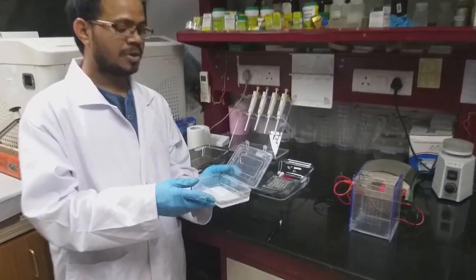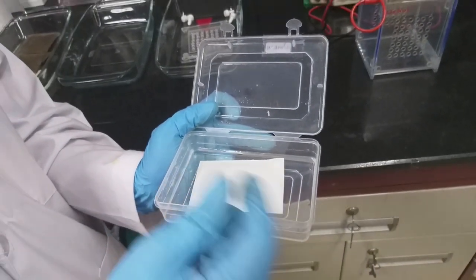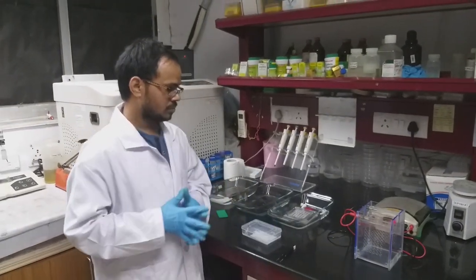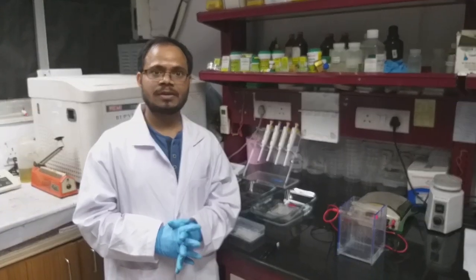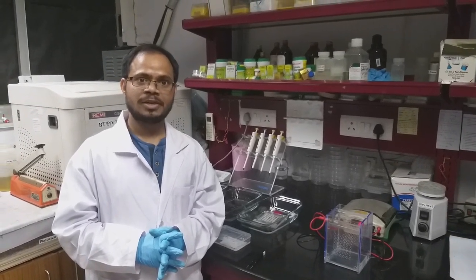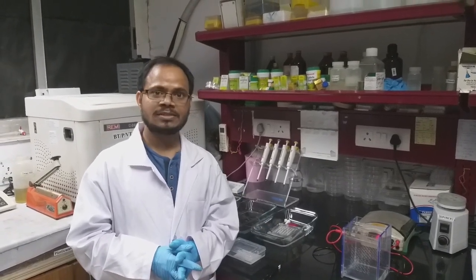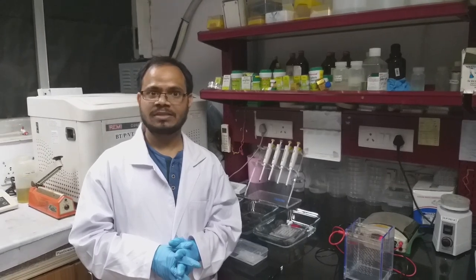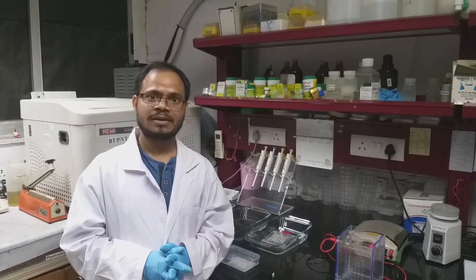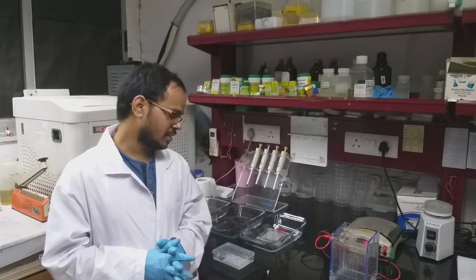So this is pre-soaked in methanol and equilibrated in transfer buffer. While doing transfer, we need to consider a few things. The buffer always should be in chilled condition, otherwise during this transfer at high voltage it will generate high temperatures, so that may degrade your protein or decrease the efficiency of the transfer. That's why we need to keep the buffer always in chilled condition.